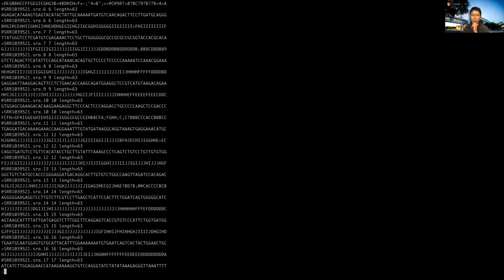I don't think so. The RIN score should be the quality of your RNA sample, so you have one score per sample. Please correct me if I'm wrong. For the sequence reads, we have a score associated with each base of each read. The score is basically the quality of the fluorescence signal when we detect, because Illumina detects per base based on the fluorescence signal.